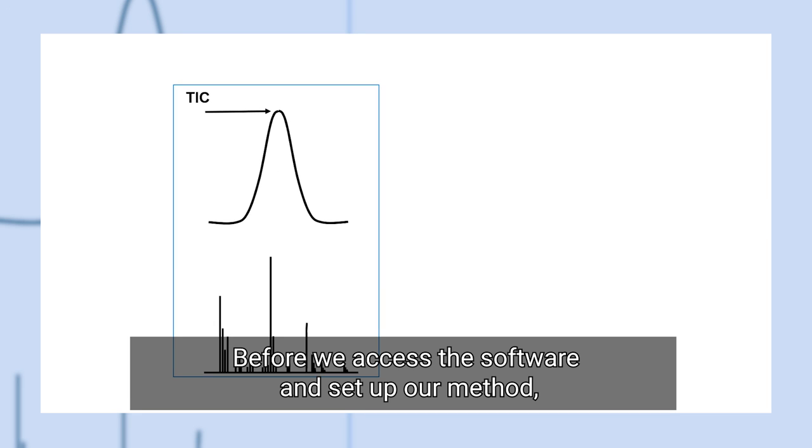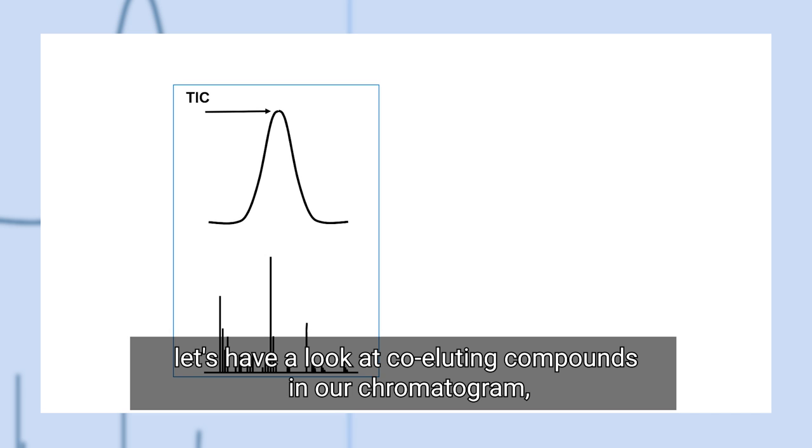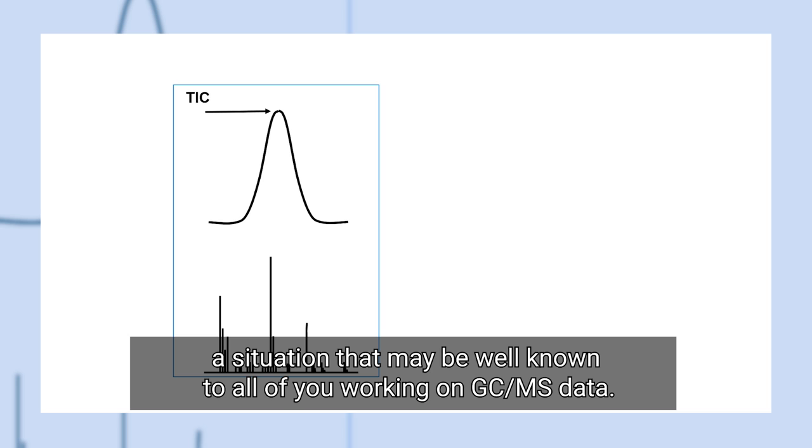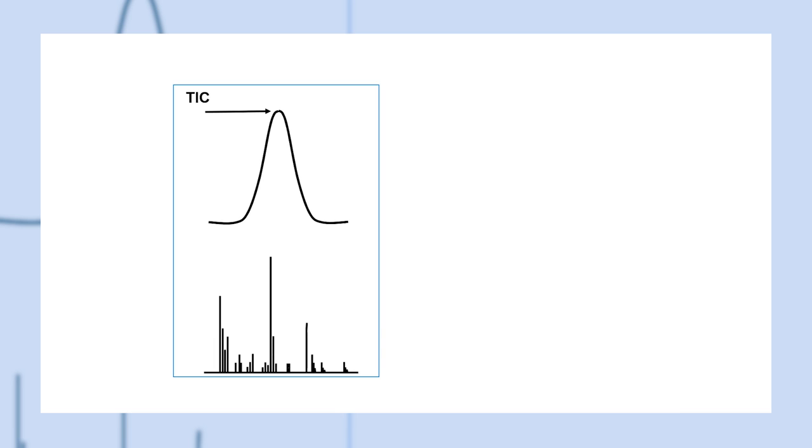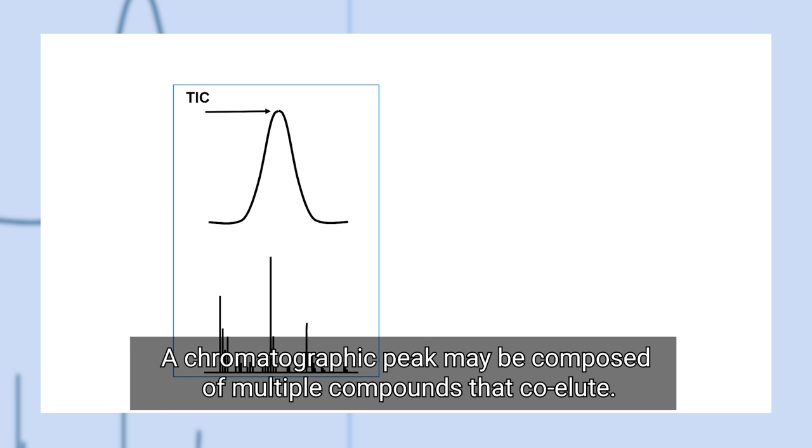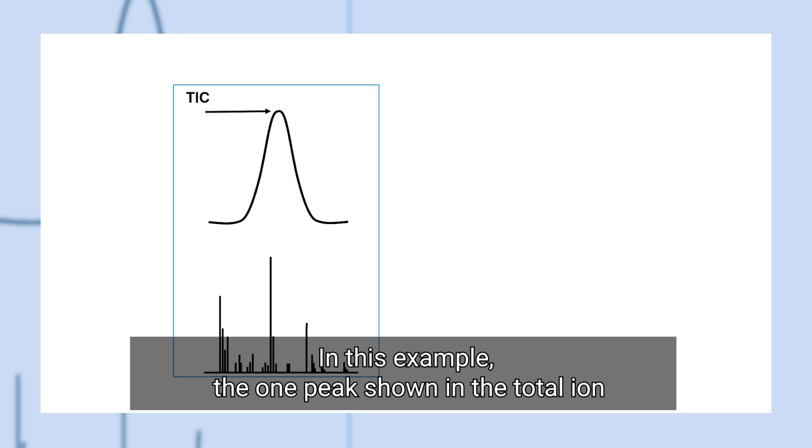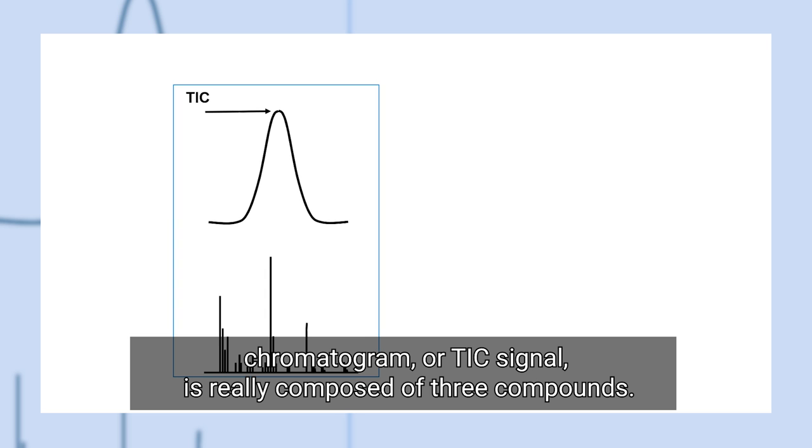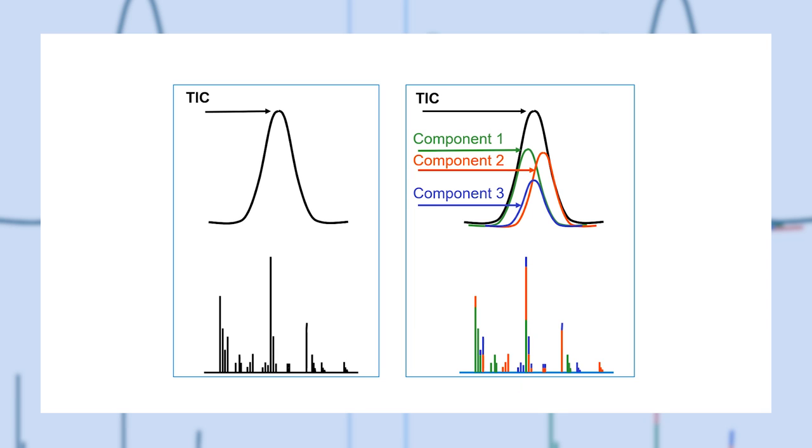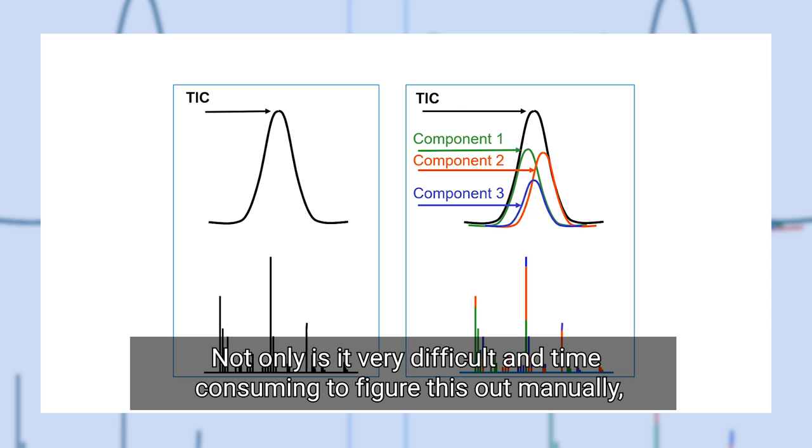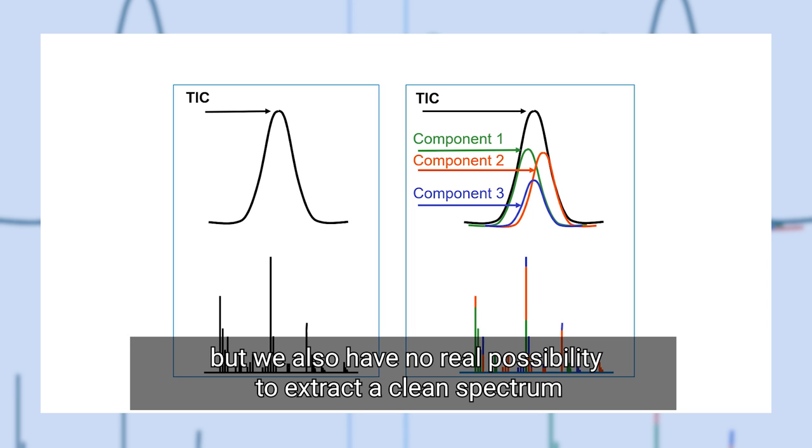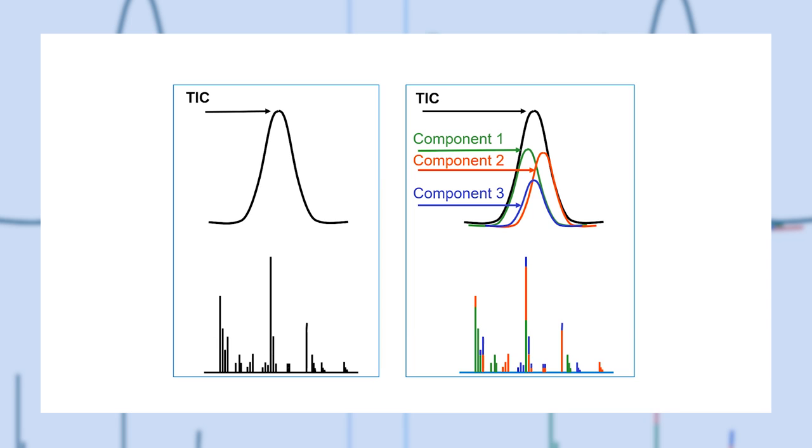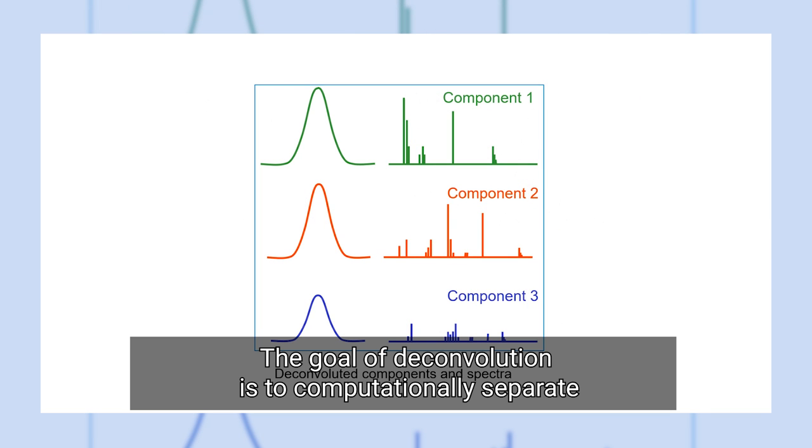Before we access the software and set up our method, let's have a look at co-eluting compounds in our chromatogram. A situation that may be well known to all of you working on GC-MS data. A chromatographic peak may be composed of multiple compounds that co-elute. In this example, the one peak shown in the total ion chromatogram or TIC signal is really composed of three compounds.